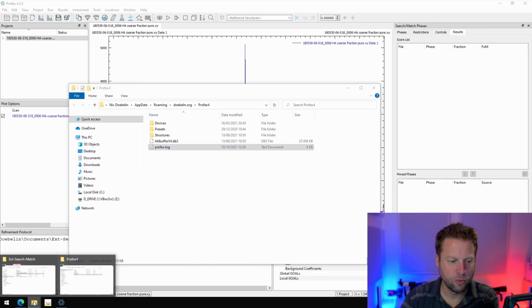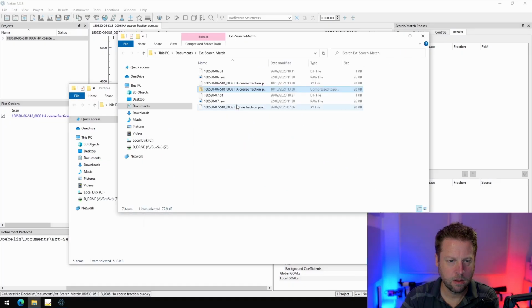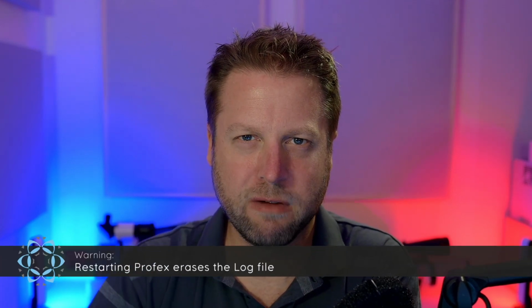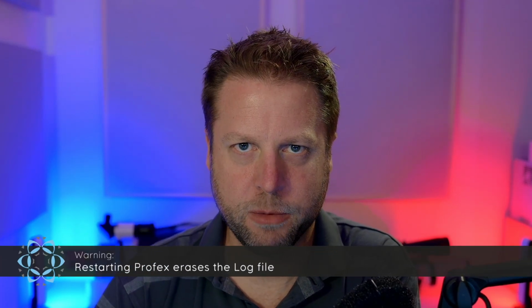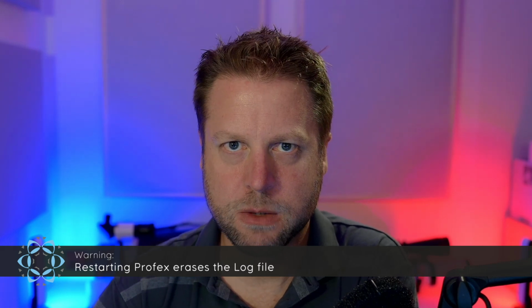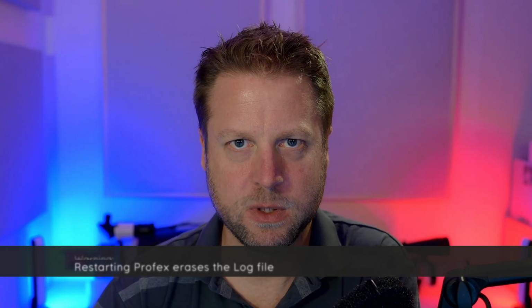So you also attach this. You attach the two files, the archive and the log file, to an email and send it to me with a description of your problem. It is important that you send me the log file before you restart Profex again, because the log file is erased every time you start Profex, and the log of the problem you reproduced will be lost next time you start Profex.